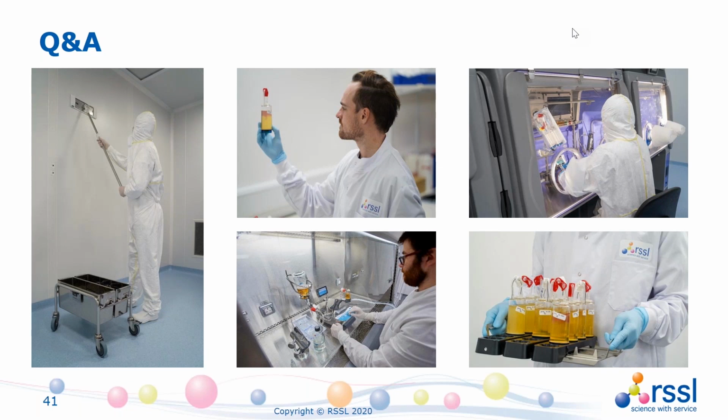On the other side, there's the complete belt and braces approach, which is to assume that there's always going to be residues. So the company in that situation would always introduce, say, a WFI rinse or an alcohol rinse in between each detergent and disinfectant step. So again, there's no hard and fast rule, but it's something that you need to reach a position on, because it's a question that regulators are starting to ask more often, and also appears in the revision to Annex 1 as a concern.